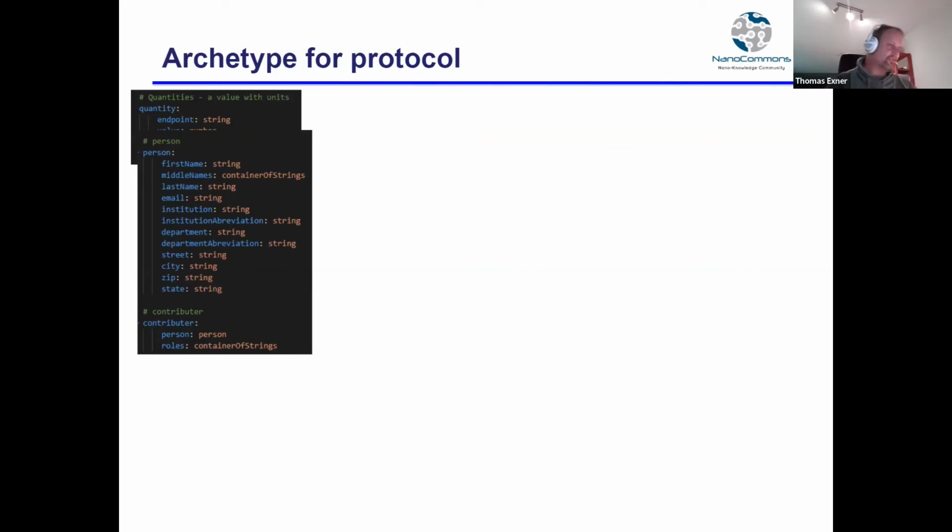Yes, here ontologies are coming in, because I just need first name, I just need middle name, and so on, and assign that to the ontology, and I know what I'm talking about. Here it's easy. If you go to the more scientific part or the more essay-specific part, then we probably have to define the ontology or the ontology terms, but in principle it's possible.